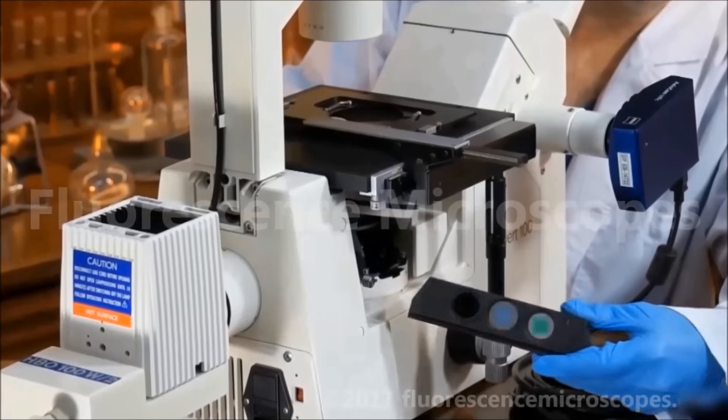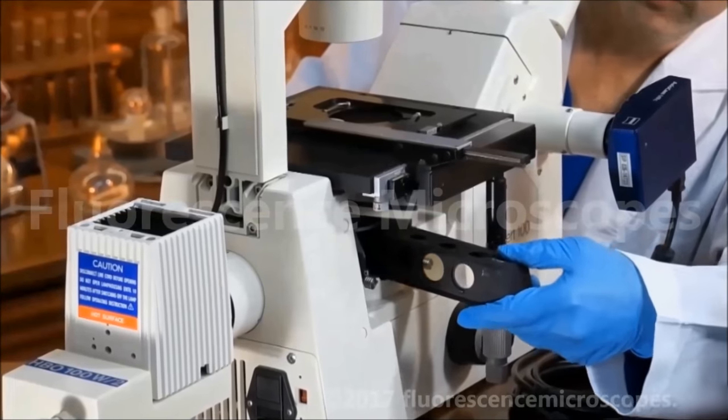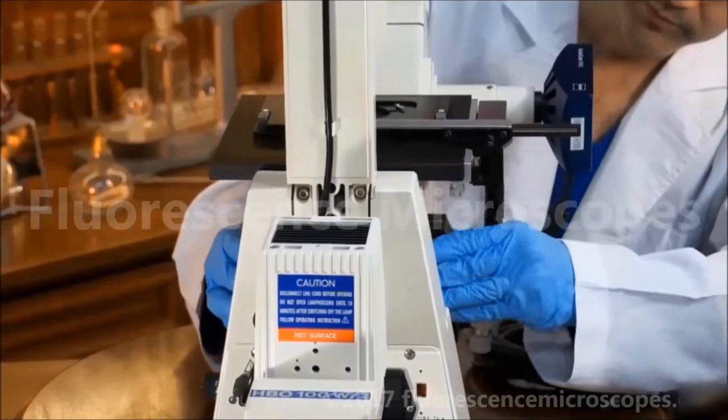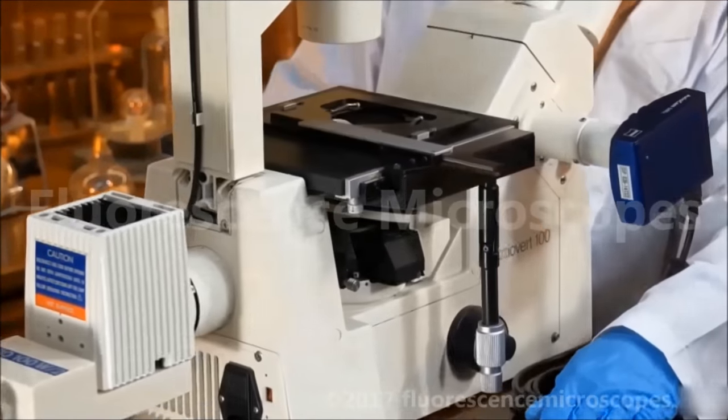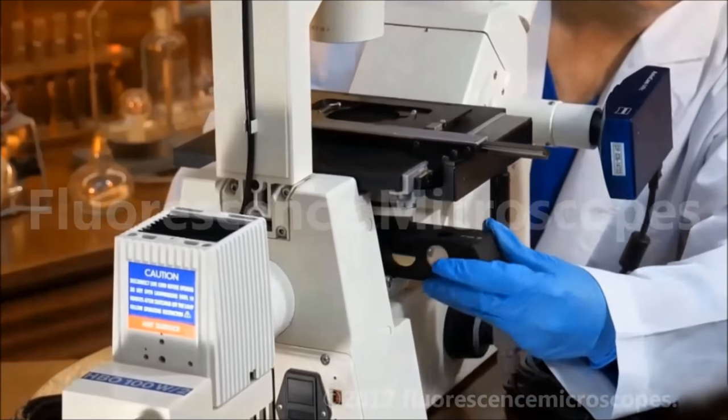This is the cube tray. You'll have to look at the ad to see which filter sets are included. It takes just a minute to take out the cube tray and to put in another.